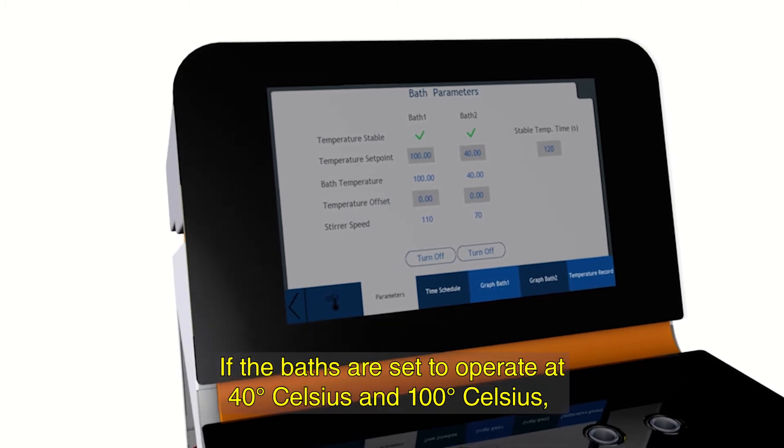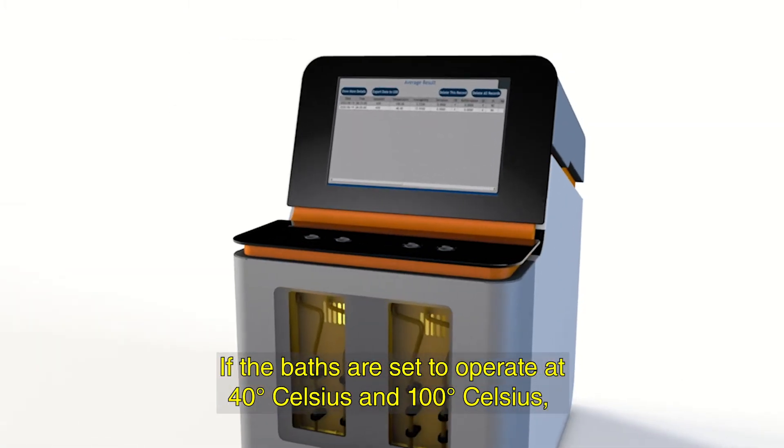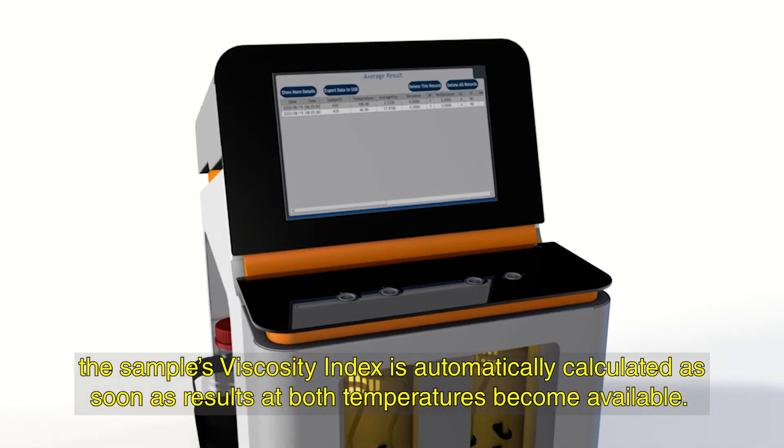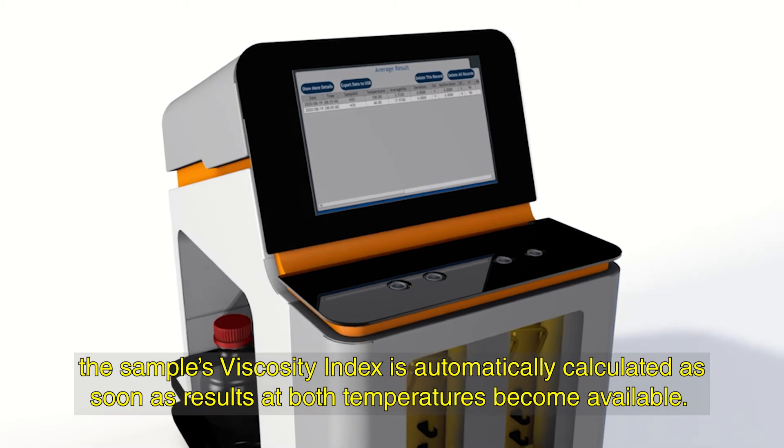If the baths are set to operate at 40 degrees Celsius and 100 degrees Celsius, the sample's viscosity index is automatically calculated as soon as results at both temperatures become available.